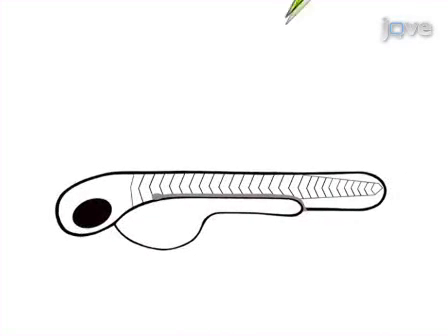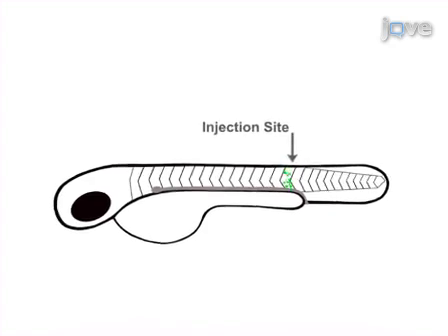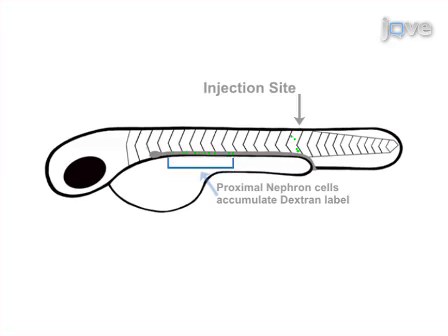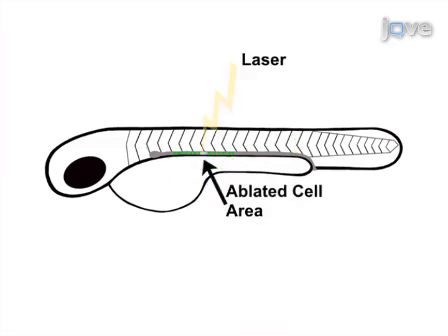This is accomplished by first microinjecting zebrafish embryos with a dextran fluorescent conjugate. During an overnight incubation, the conjugates are selectively absorbed by nephron proximal tubule cells. The next day, the cells are examined under epifluorescence and selected cells are ablated using a pulsed laser system.